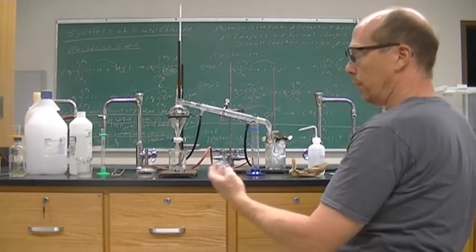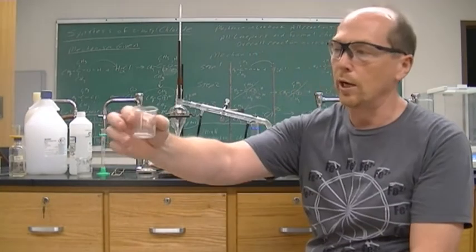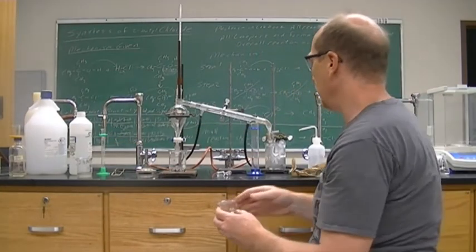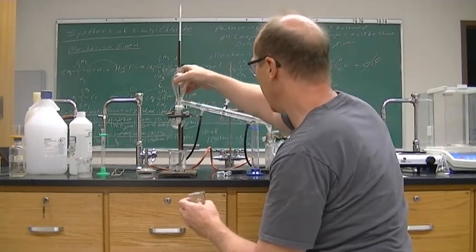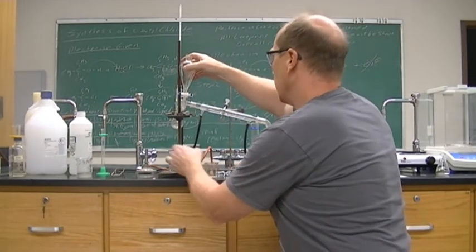All right, and so we have calcium chloride, which is a white solid that is going to absorb, it's going to take in all of the water.